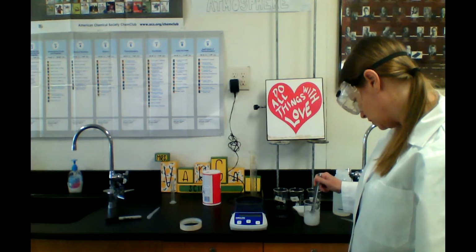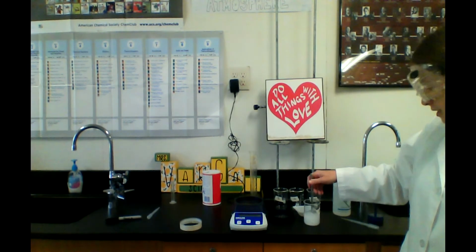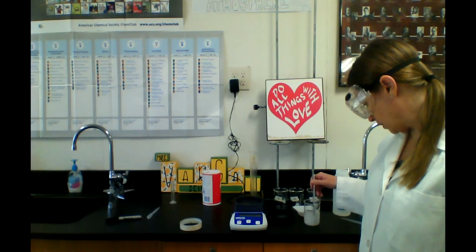Remember from our pre-lab, we're going to start by preparing the 20% sodium chloride solution. We're going to take from this 100 milliliters of stock solution that we just prepared, and we're going to measure out 16 milliliters. 16 milliliters of this stock solution.